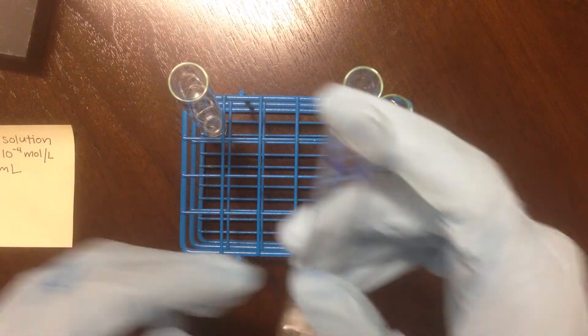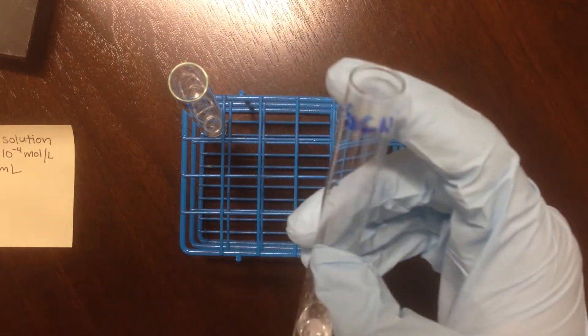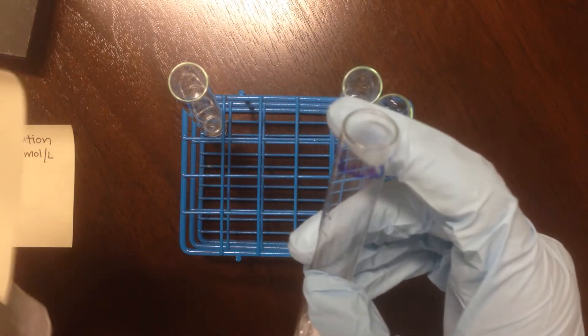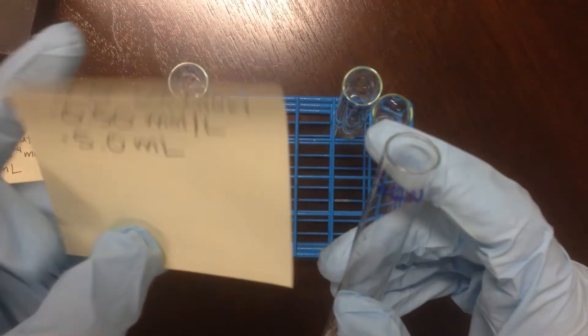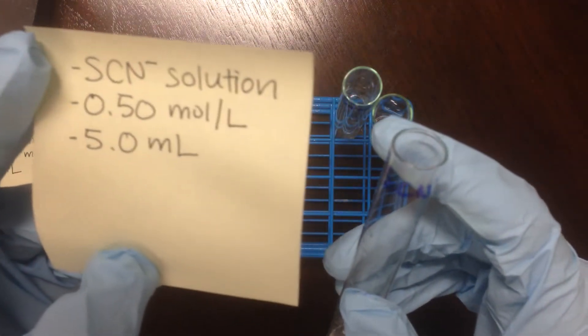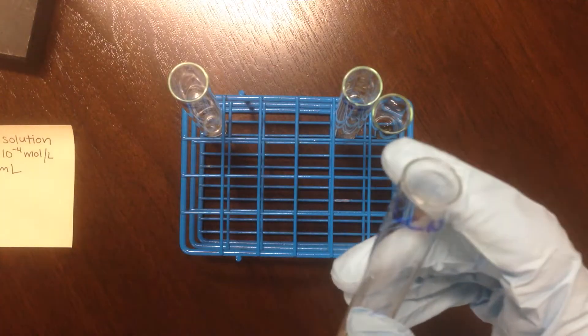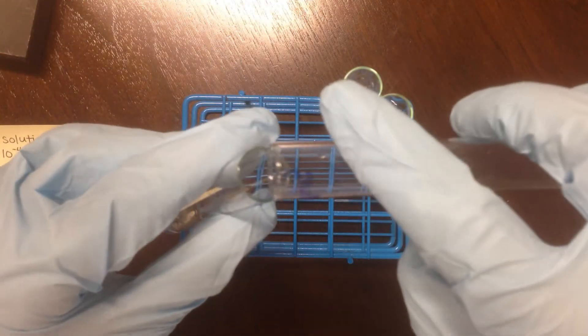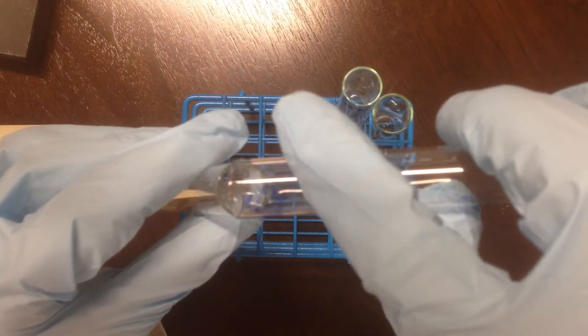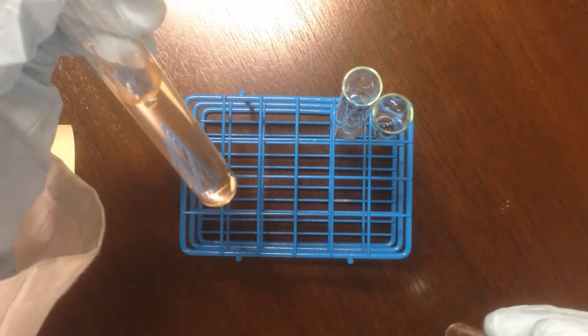Finally, I have the concentrated thiocyanate solution. This is SCN⁻, or thiocyanate, 0.5 moles per liter and 5 milliliters of that. When I add this in, I observe a nice color change to light orange.